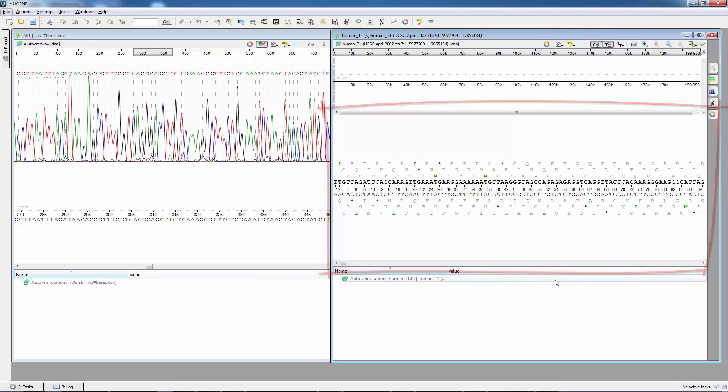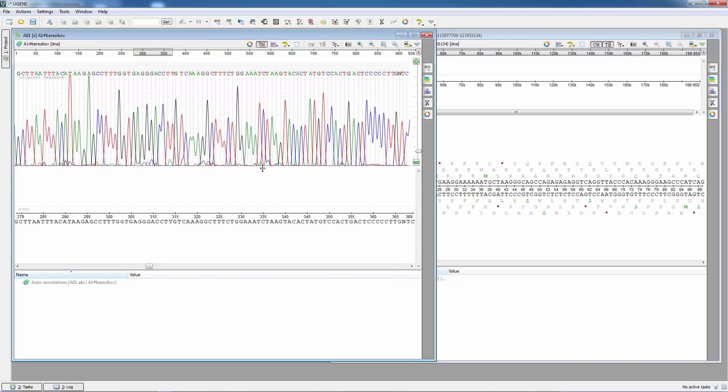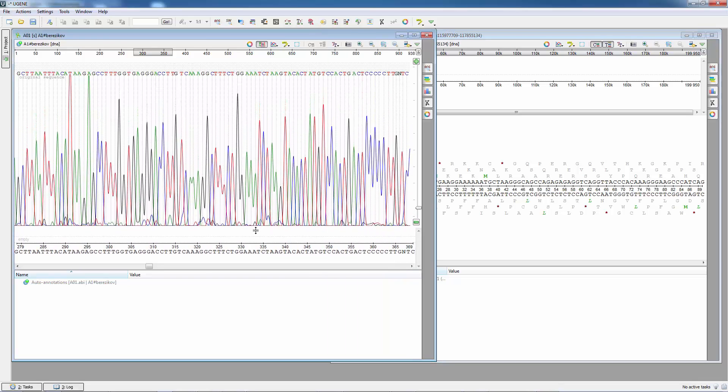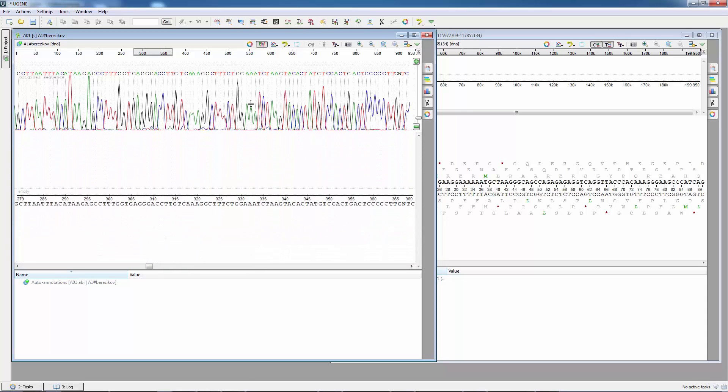Also, it is possible to resize other subviews inside the sequence view. For example, you can resize the chromatogram view by dragging its border up or down.